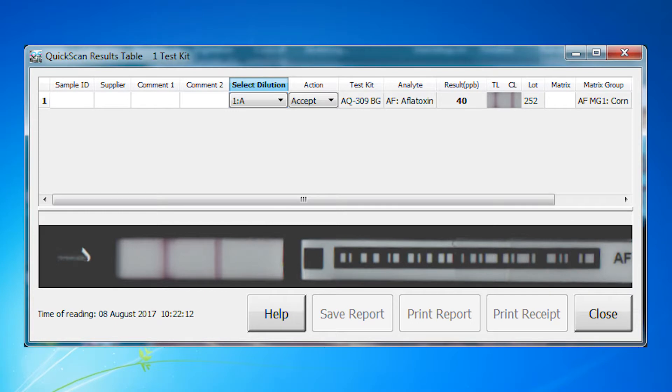Step 6. On the quick scan results screen, choose 1A under the dilution tab drop-down menu. The system will calculate and record the aflatoxin level in the diluted sample.